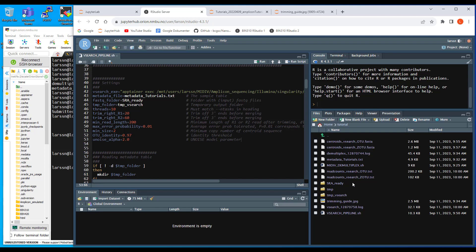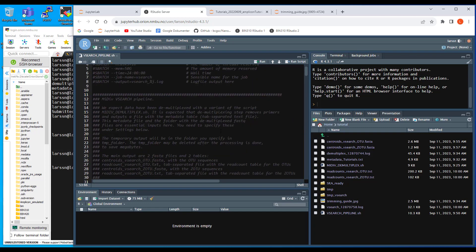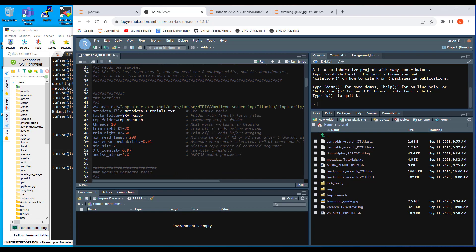And then write this one to a file again, that's a text file if you want to do that. But let's not dwell with that. The other, the more important outputs are these two fasta files with centroids. And notice this vsearch is doing actually two types of processing, right? You do first ordinary sort of OTU clustering, the classical one, and here we used identity 0.97. You may edit this of course.